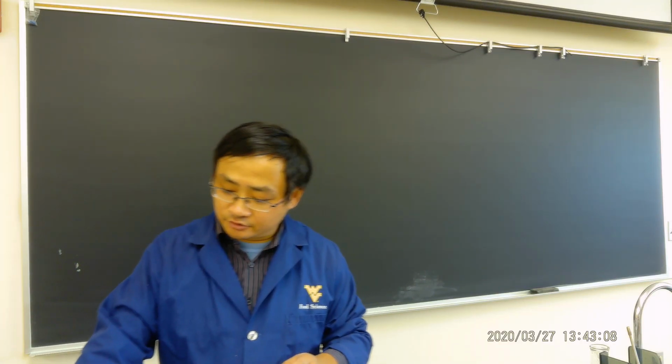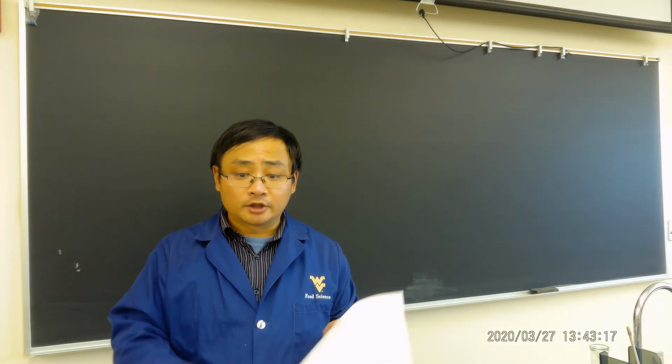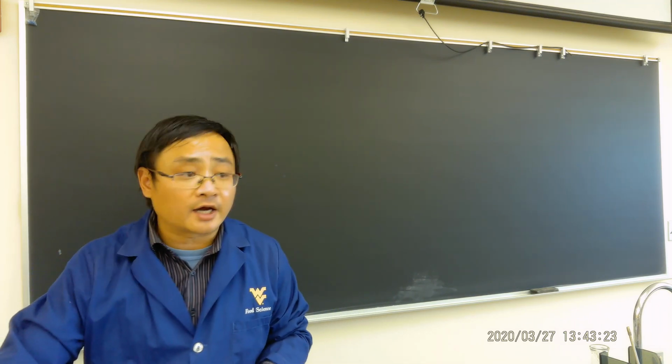Okay, we're going to have a short class today. We will do some of the testing for biochemistry test 2 and some new material. First of all, everybody should look at your SIM agar.